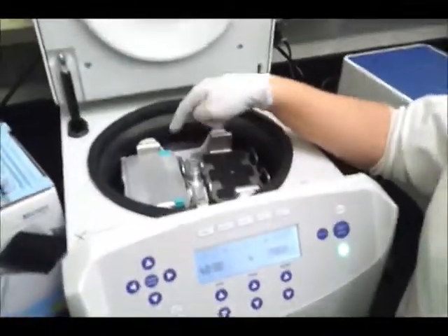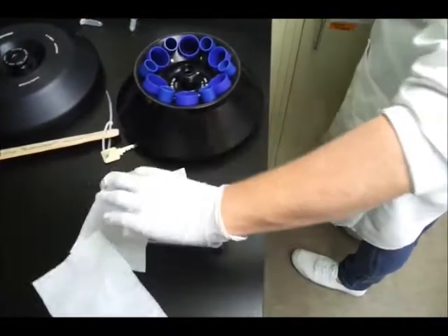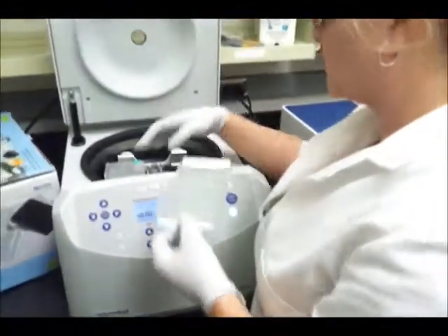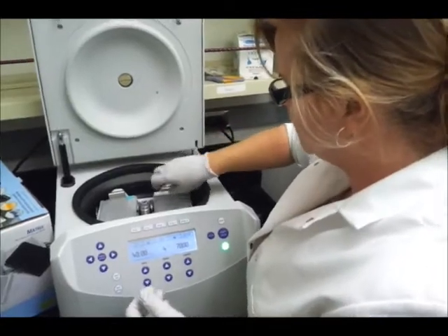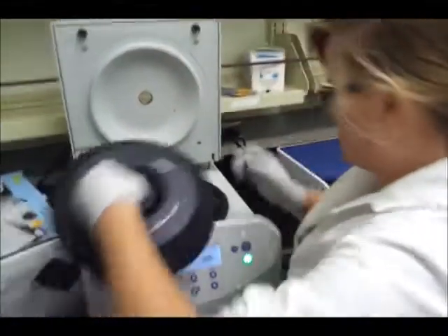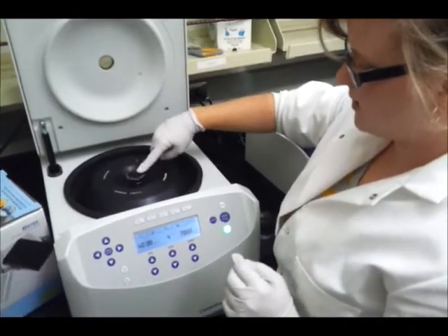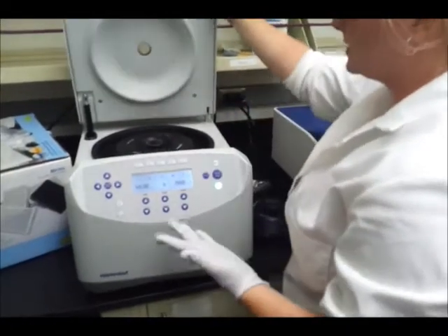Oh, okay, so there's already a balance here. It's got the green tape on it so you know that it's yours. Plus, I've left the white sides here so I can tell the difference between the two plates. You would know because this would have no volume in it. It's not covered, whatever. So you put your plate there. Close it. So you put this down and you basically secure it until you see the red thing pop up, and that is good to go. You don't have to do any other tightening. You've tightened the rotor inside. You've covered it. The red has come up, which means it's secure.